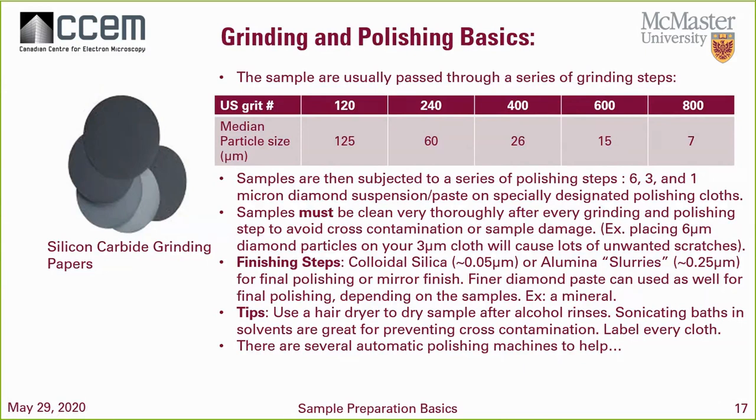because that's what I want to make sure that you do as well: after every grinding step, you look at a light microscope and check your scratches and your directions. You want to make sure that you're polishing well. Let's say all of a sudden you're at 1 micron and you start to see 6-micron scratches on your sample, you have to go back. So it's important that you clean, and I recommend ultrasonically cleaning it in solvent baths after every step. In grinding it's not so important, but I definitely recommend it in the polishing steps with the diamond paste. Again, label every cloth to make sure that you don't make any mistakes.